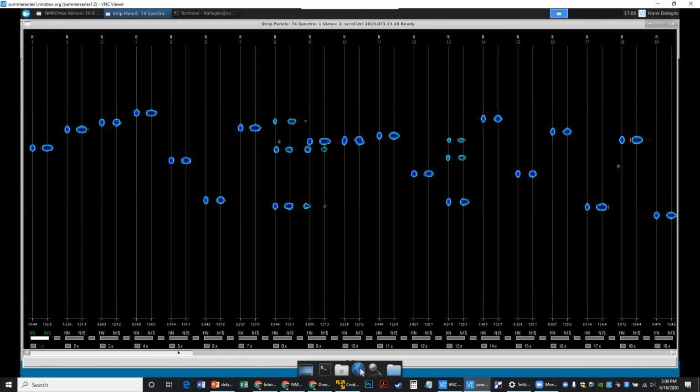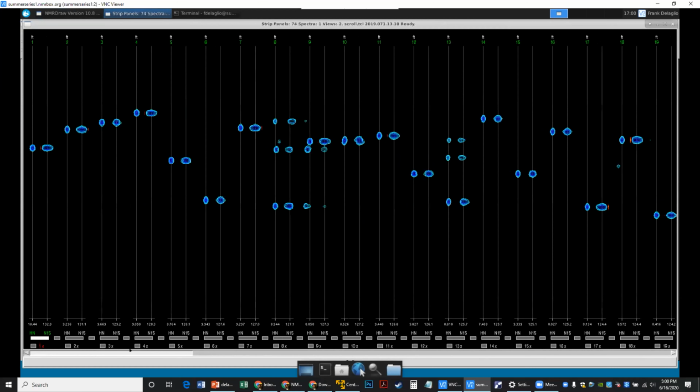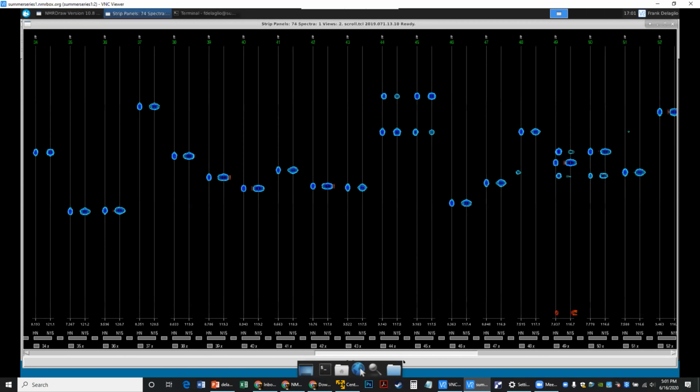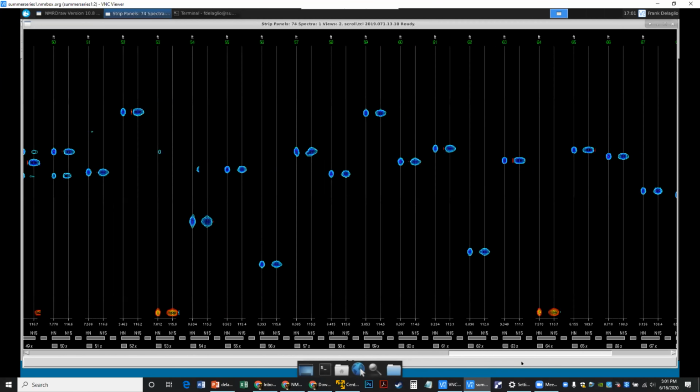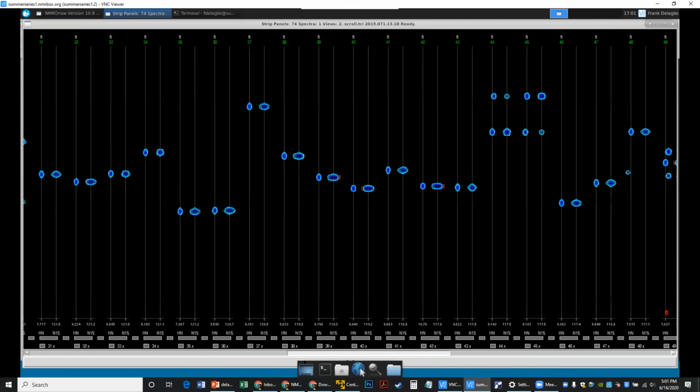The way this function works is that it takes a 2D projection of the data, performs peak detection on that 2D projection, and then at the position of every 2D peak that it finds, it draws a pair of strips in this graphic. In this case, one strip is along the proton dimension, and the other strip is along the nitrogen dimension in the short axis, and both strips are along the carbon dimension in the long axis of this display. So this strip plot allows us to see what the peak profiles look like throughout the entire spectrum. This lets us see that the data is phase corrected well in all places. It lets us see what the line shapes look like in all the dimensions.